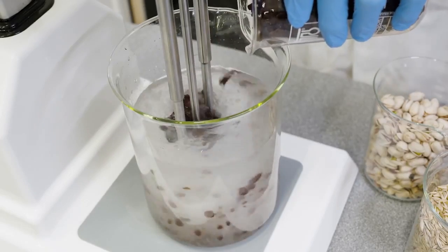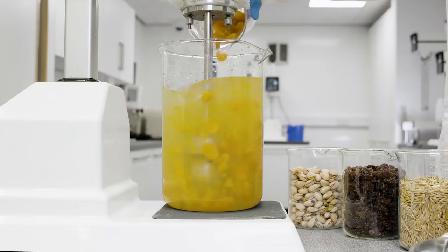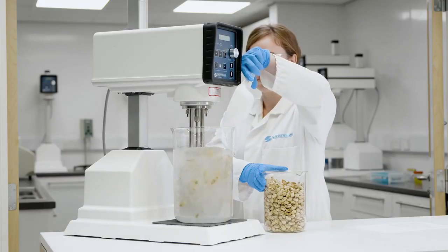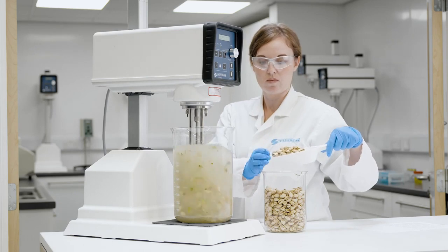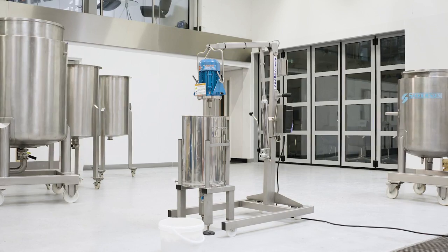Silverson mixers can also handle a wide range of viscosities and materials of different sizes and shapes. They are also easier to clean than traditional milling and grinding equipment. We offer mixers for a range of sample batch sizes, from laboratory mixers up to units for 90 kilos or roughly 200 pounds.